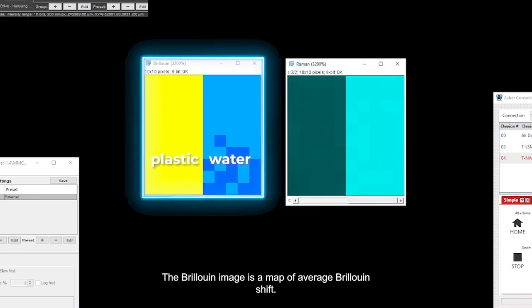The Brillouin image is a map of average Brillouin shift. Again, we see the shift is higher inside the plastic and lower in water.